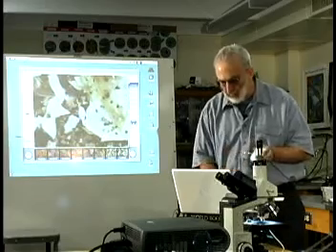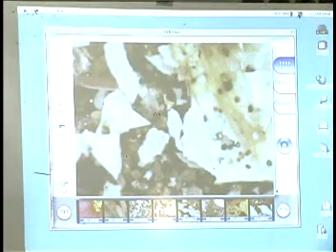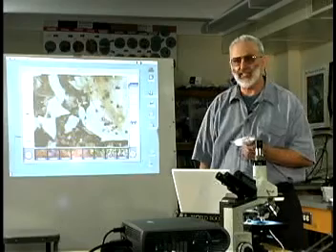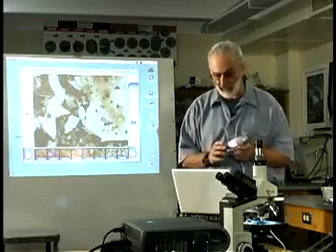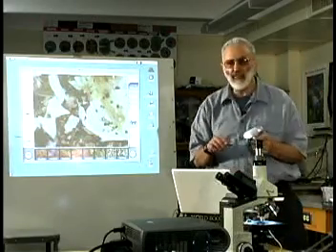And what we have now are biologics. So what we have here are different shell samples, different fragments where shells have broken apart. And what we're going to look at more closely, and we'll switch lenses to look at, is exactly what kinds of shells these are and any other parts that we might find. For example, here we have a nice hydroid colony that's attached to that particular shell, and we'll be able to look at it and also each of the zooids, each of the little animals that it's made up of.